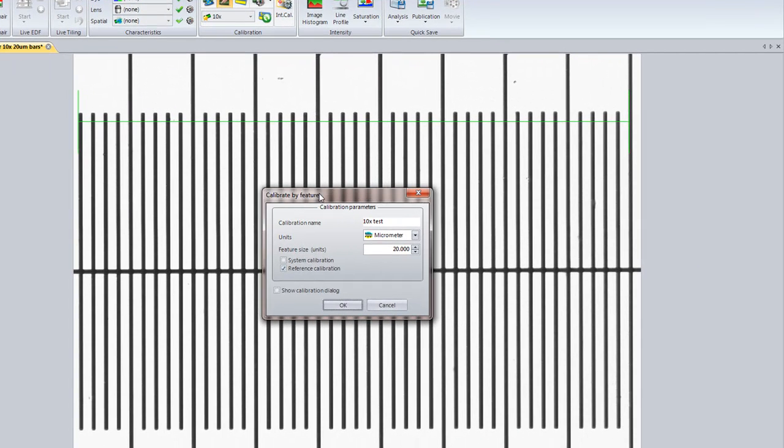And now I need to give a name to this. I'm just going to call this 10x. I'm just going to give it an A designation because I'm creating test calibrations right now. Give it the number of units. Tell it what this distance is. In this case, this is 880 microns.